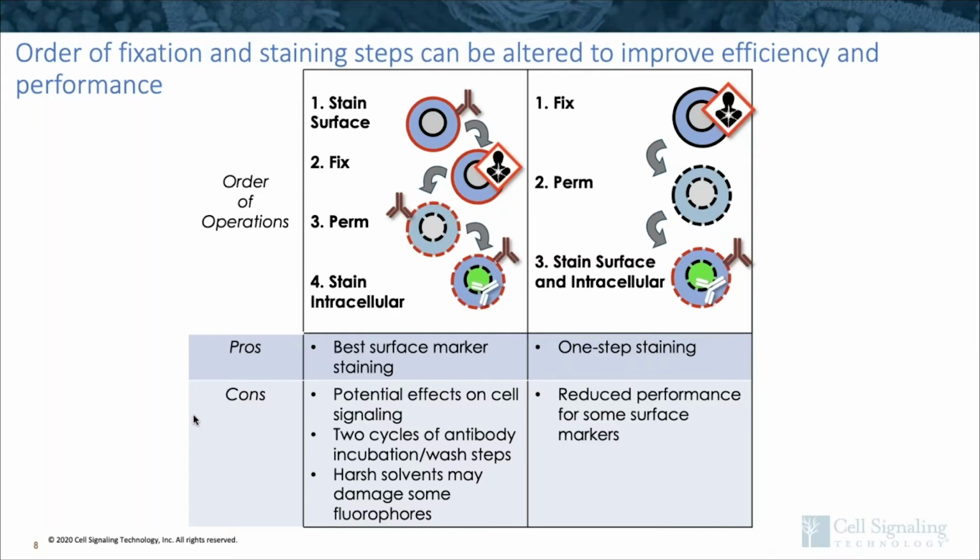You'll also need to be careful about the fluorophores that you're using on your extracellular antibodies, really only if you're carrying through an organic solvent in the permeabilization step. This is because organic solvents will denature proteins like PE and APC. Small molecule fluorophores, on the other hand, like the Alexa Fluors, will be able to survive that permeabilization step in methanol without losing any of their fluorescent properties.